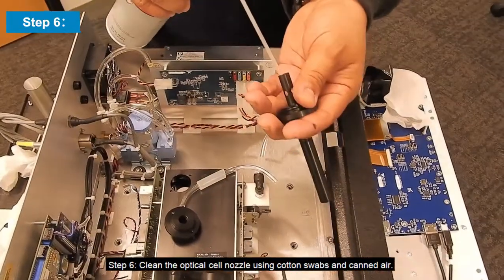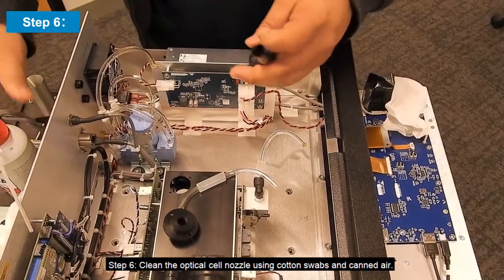Step 6: Clean the optical cell nozzle using cotton swabs and canned air.